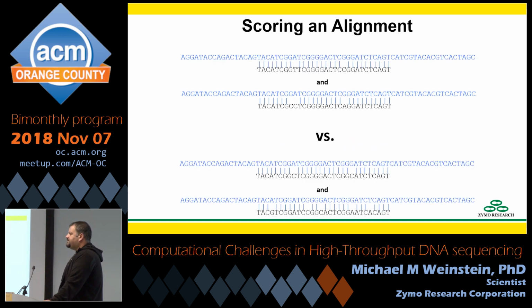Here, it's giving some examples of where you're looking at the best match and the next best match. So here, the best match is basically a 2-base variation versus a 3-base variation. And then the one below, you have a 2-base variation versus a 5-base variation, which is the next best alignment for that sequence. Obviously, you're going to be more confident when your next best alignment is a much worse alignment. You're going to be much more confident, yes, this sequence definitely comes from this place.